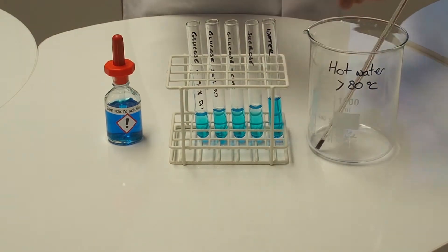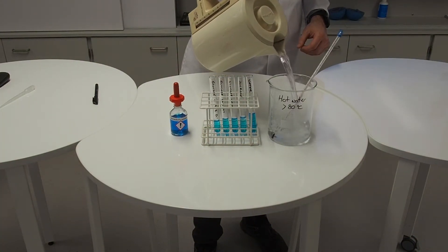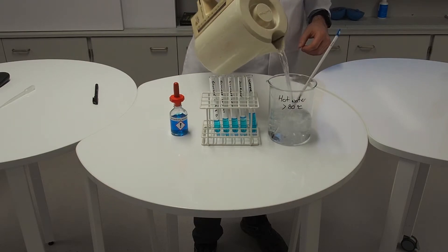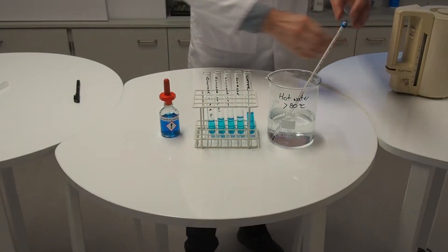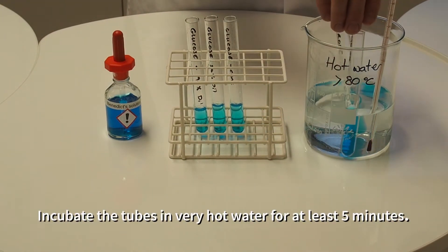In order to make the Benedict's test work, the tubes have to be incubated in very hot water. Ideally, it should be over 80 degrees C. We're just using water from a freshly boiled kettle here, and the tubes will stand in there for in the region of five minutes.